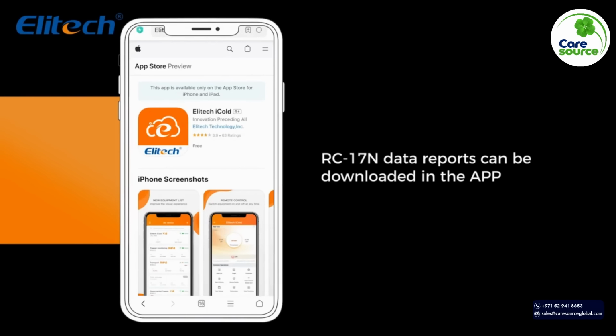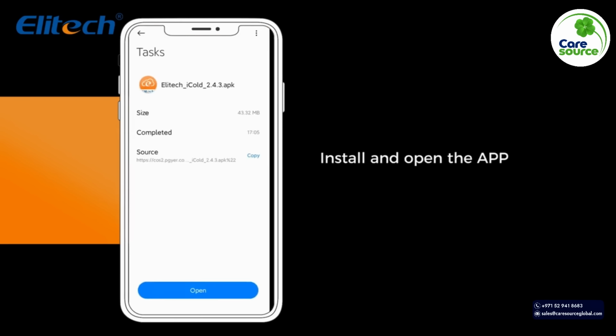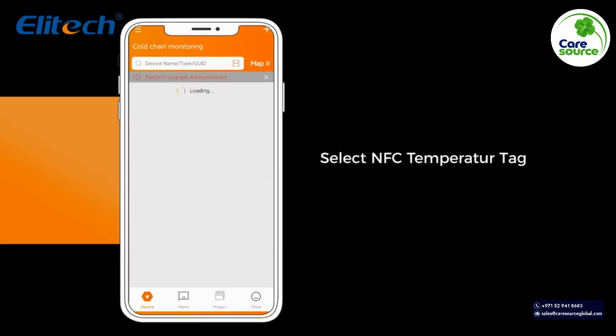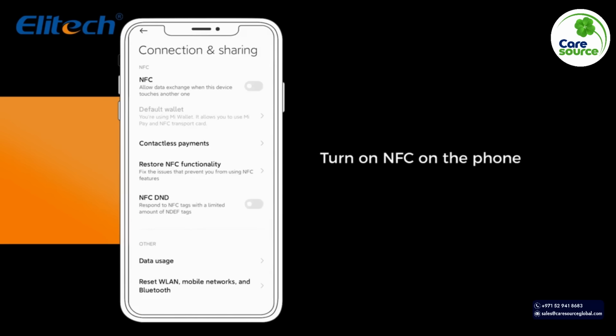RC-17N data reports can be downloaded in the App Store. Search ELITech iCold software. Install and open the app. Select NFC temperature tag. Turn on NFC on the phone.